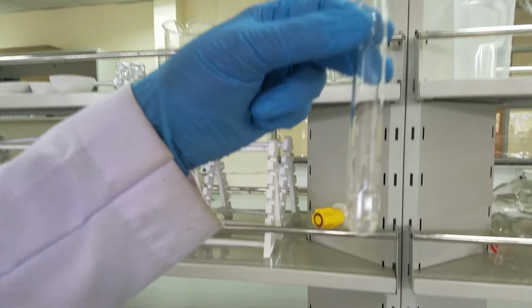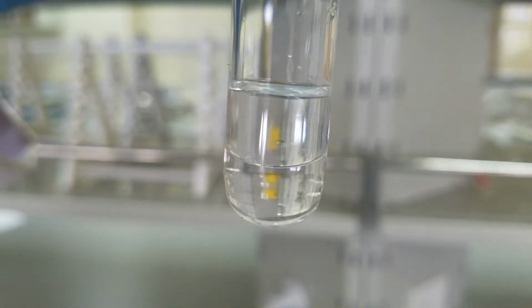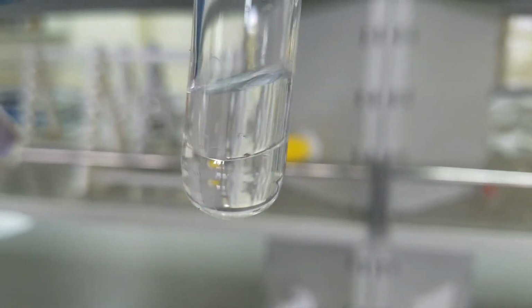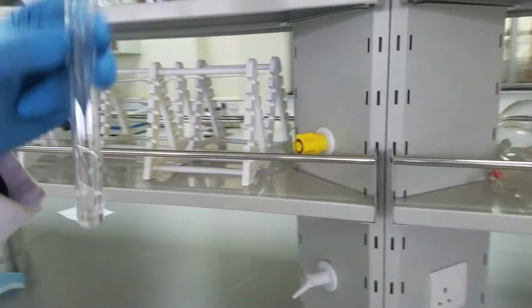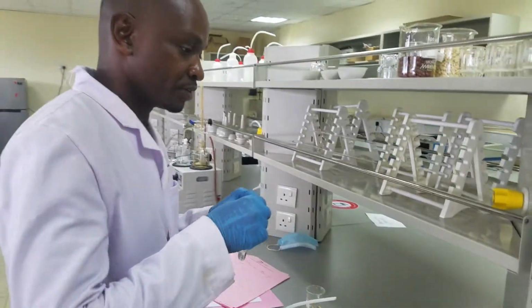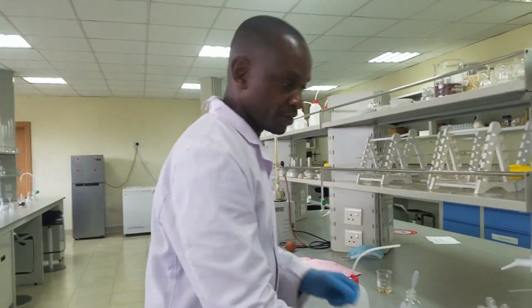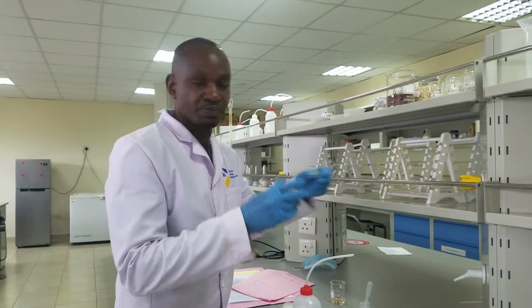I hope you have recorded. Okay, I've tried to do this, but check. Okay. So I've finished my first test. I will go to toluene, which is also here, and I'll repeat the same process.